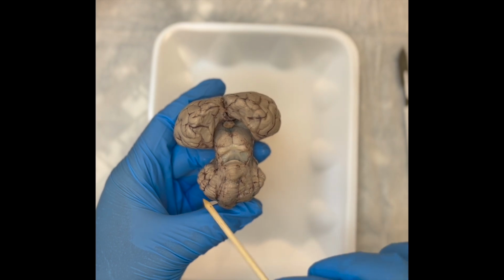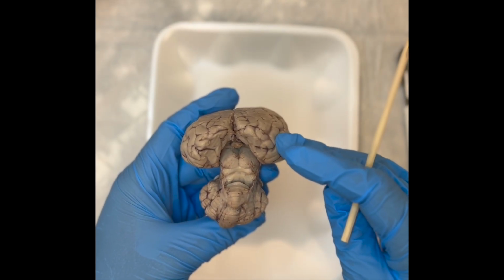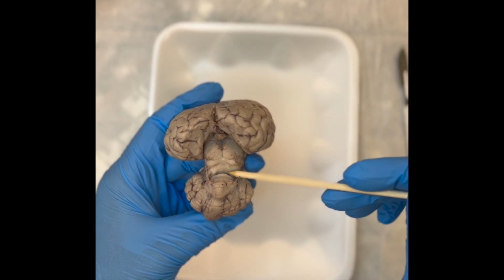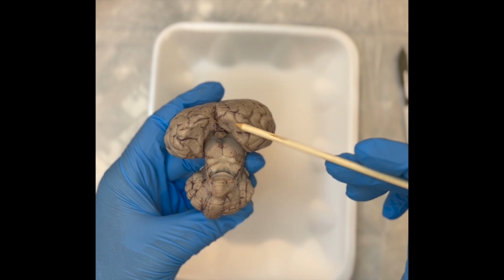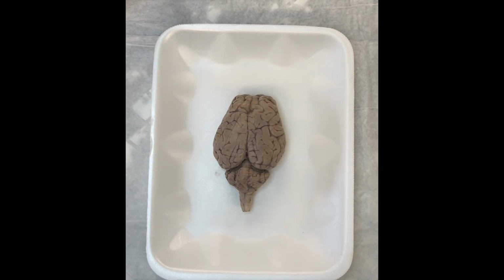Peeled back the cerebellum, so you get to really see just how separate it is from the cerebrum. Any communication going to and from has to pass through the brainstem, pass through the midbrain and the pons to get to that point.